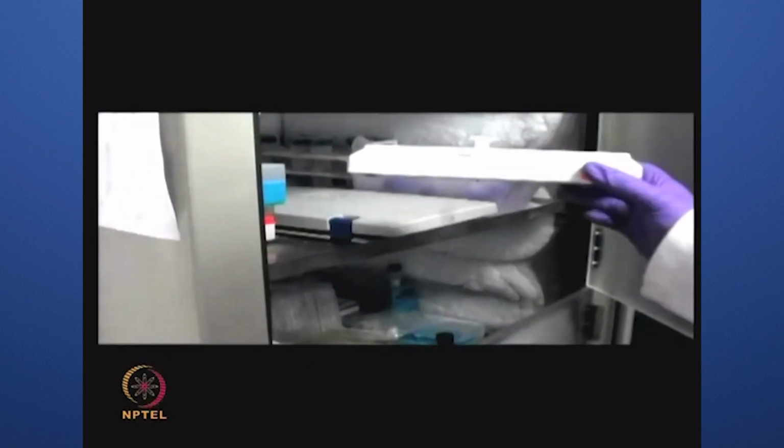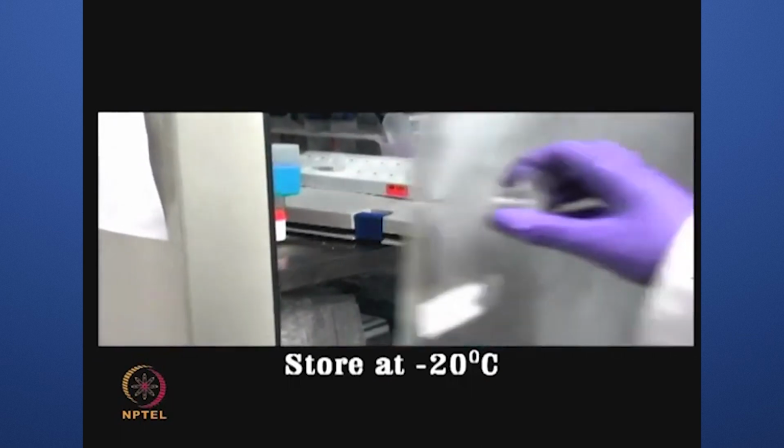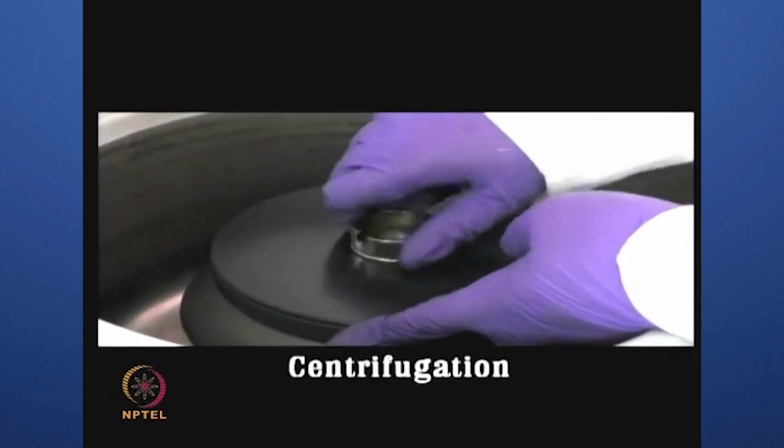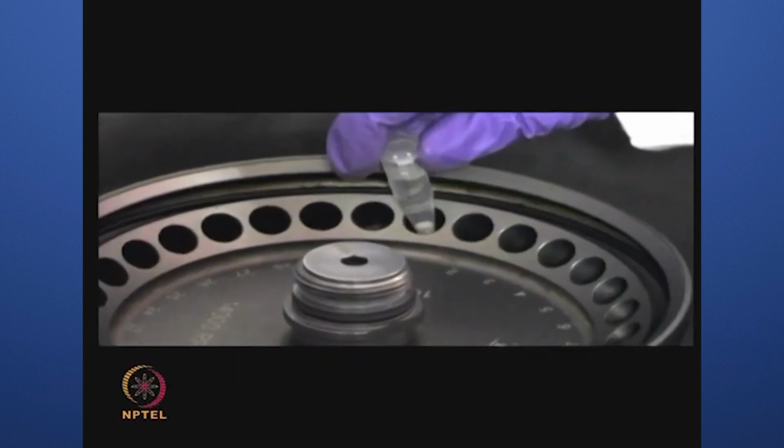The solution gradually becomes turbid due to precipitation of proteins. Place this tube at -20 degrees Celsius for at least 4 hours before centrifugation to enable complete precipitation of proteins.